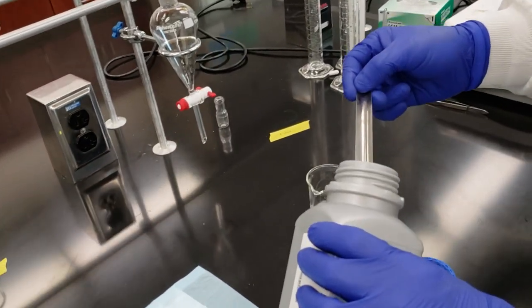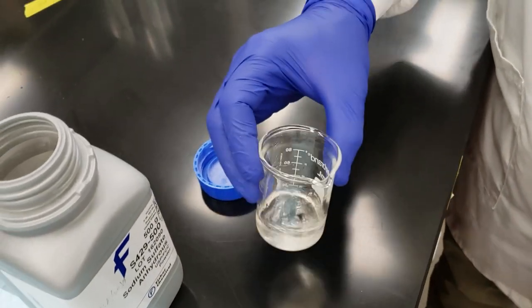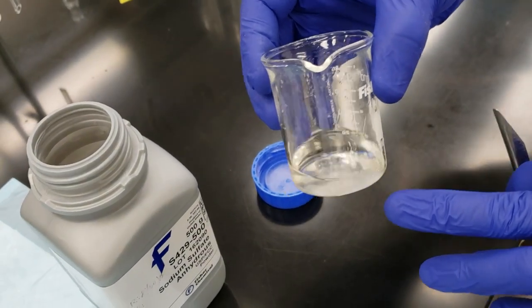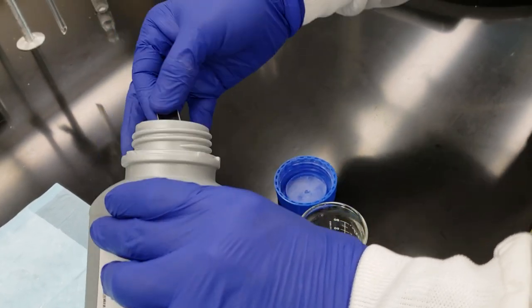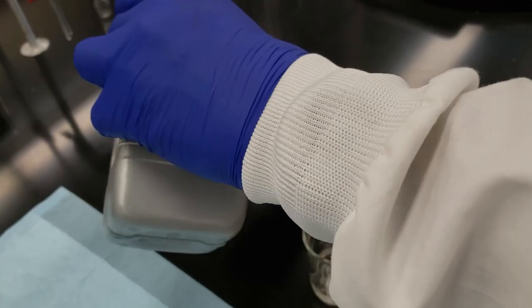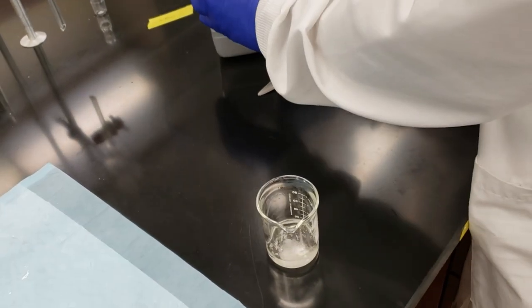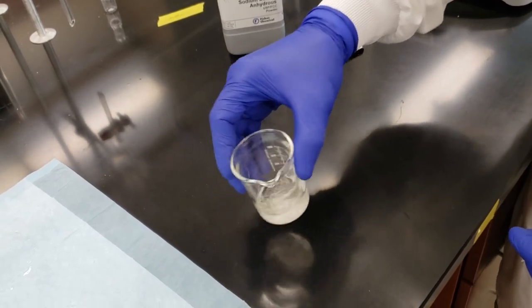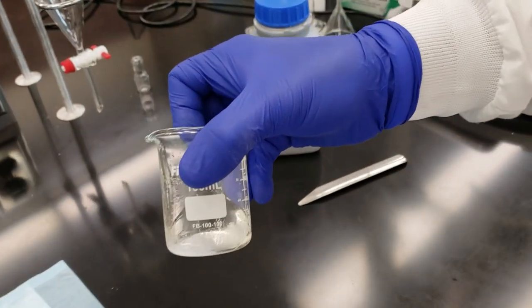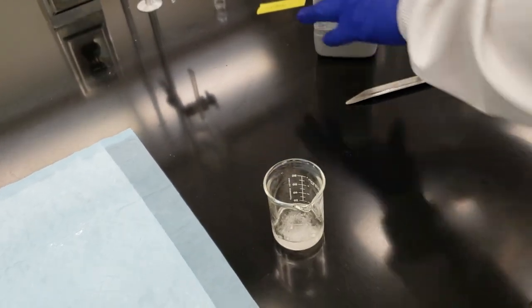Take a small amount at the end of our spatula here, put that into our beaker, swirl it around. We can see that we've aggregated. Remember that when our powder sticks to the side of the flask, we've aggregated water in solution. So I'm going to put in a little bit more. Give this another swirl. Actually, it looks like the majority of that powder has also stuck to our beaker. So we'll have to add a little bit more.